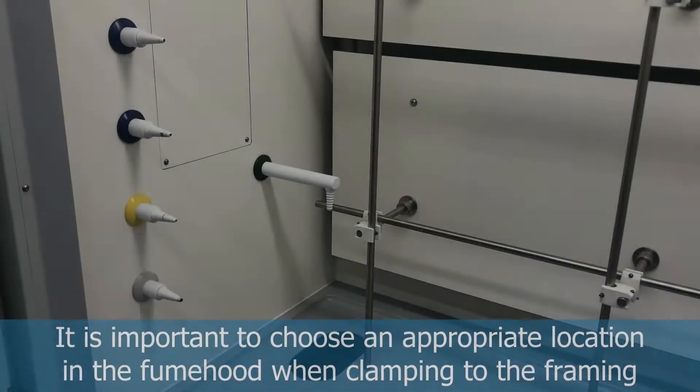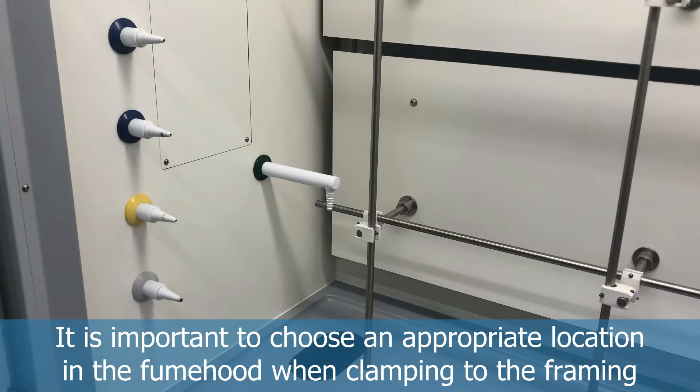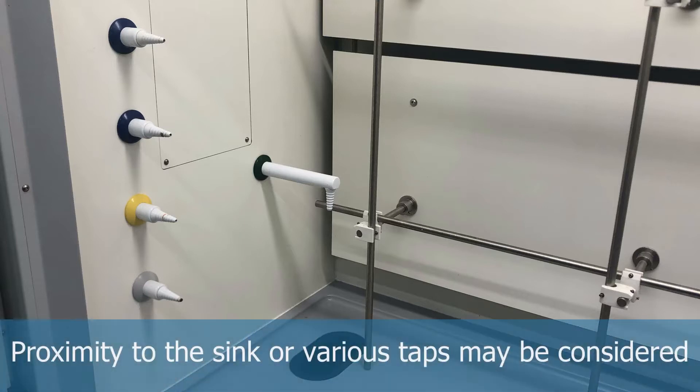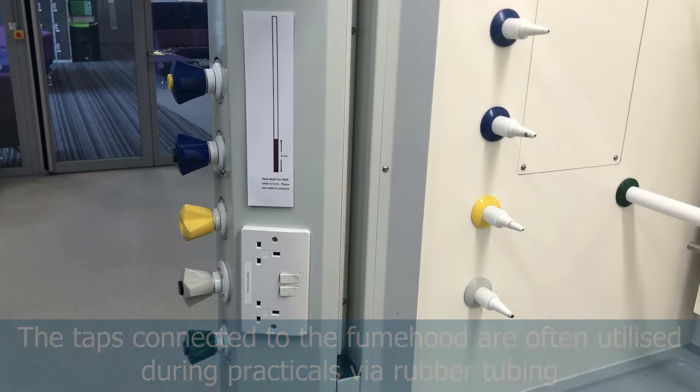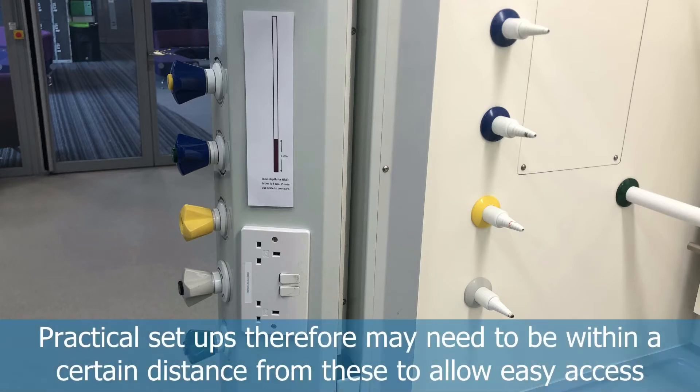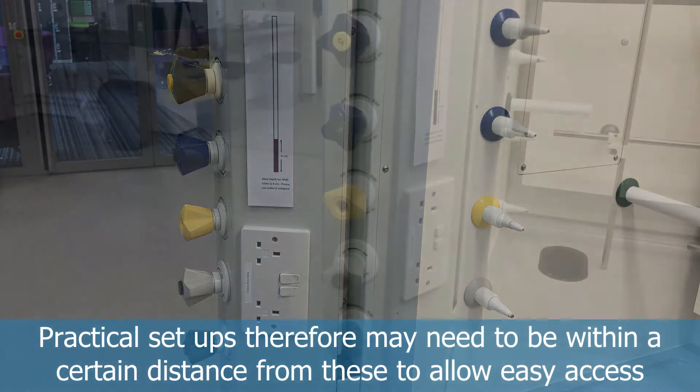Welcome to this video on where and how to clamp in the fume hood. Before you start anything, it's always good to select an appropriate location — usually somewhere near the taps that align the side, or near the sink if doing anything with water. The taps are connected to the side of the fume hood and are used with rubber tubing, so apparatus needs to be in close proximity to avoid straining any of the tubing.